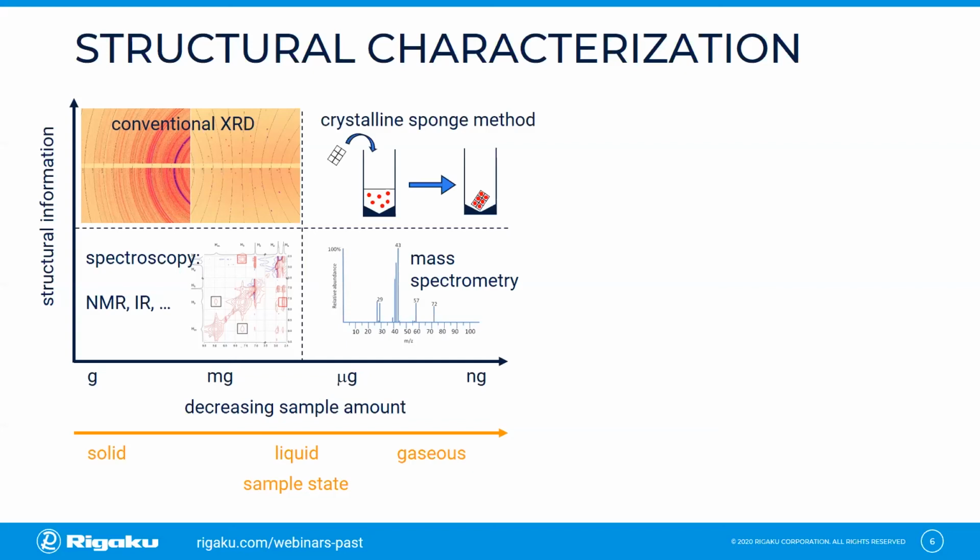You can use a metal organic framework and fill its pores with the analyte of your interest. Such porous crystals used for this method are called crystal sponges. In a simplified glance, you soak the pores of those crystals with an analyte like a kitchen sponge soaks up water.